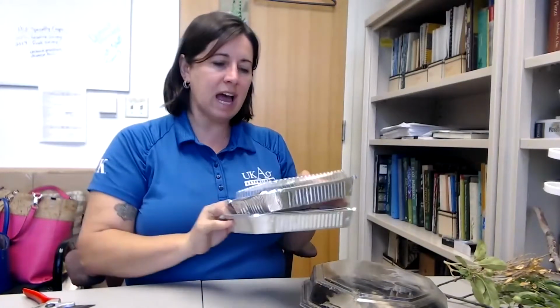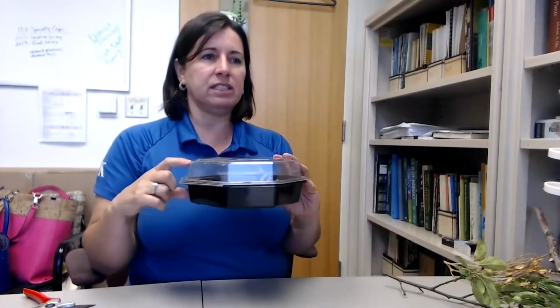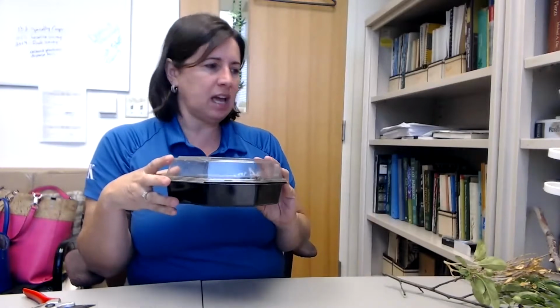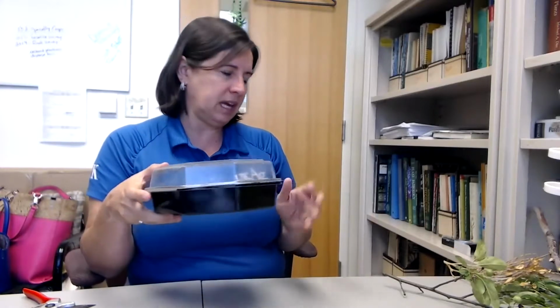I've got a whole stack of these things all over my office. They come in different sizes. This one was cookies, I think, for something that happened in the department. They always just hang around. You can wash them out and use them again. In desperate times, you can use a Ziploc bag. Just make sure that you've puffed it up and left enough air in it so that you don't have a wet, soggy sample. You don't want a soggy sample. You just want that humidity. You're creating that humidity chamber. Okay? Questions there?